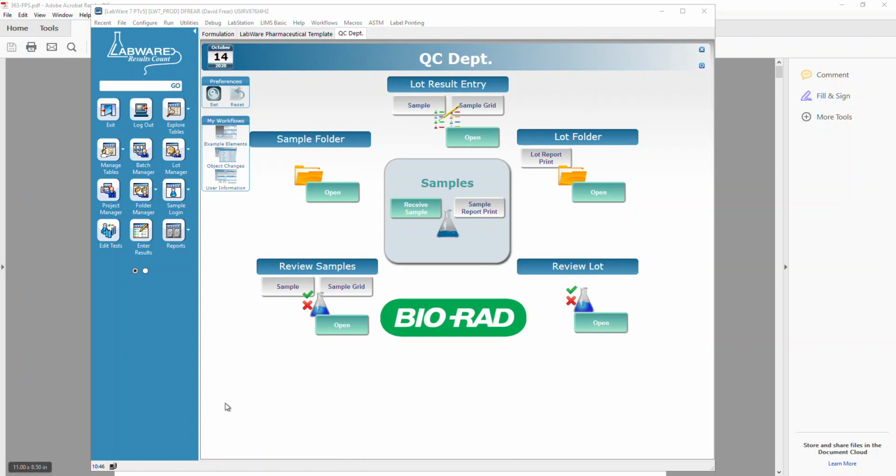Today I'm going to talk to you about the full product report. It's a very lengthy report coming out of LabWare for the time being, and so I'm going to show you how to navigate through that and understand it. First of all, running the report.